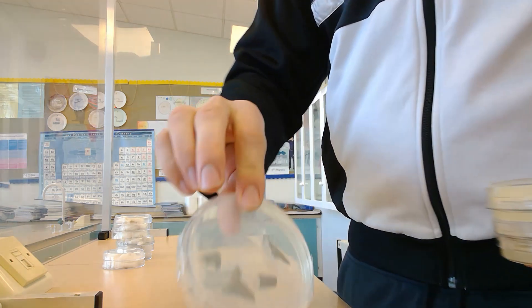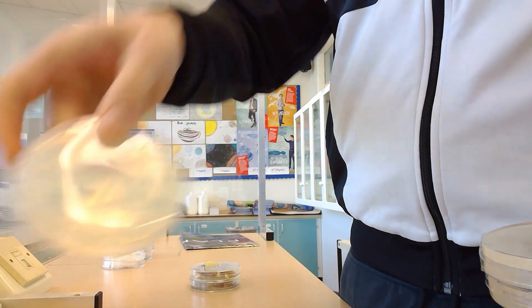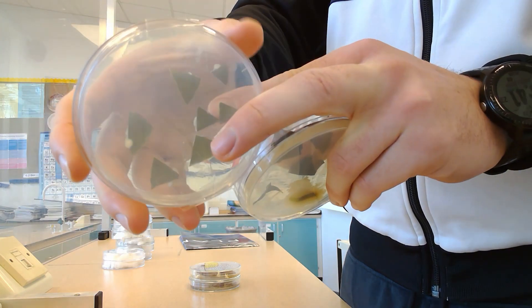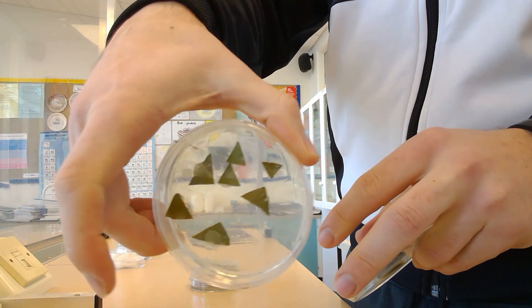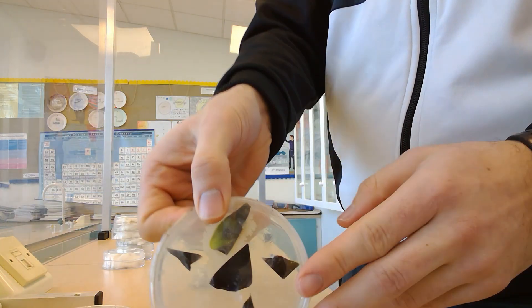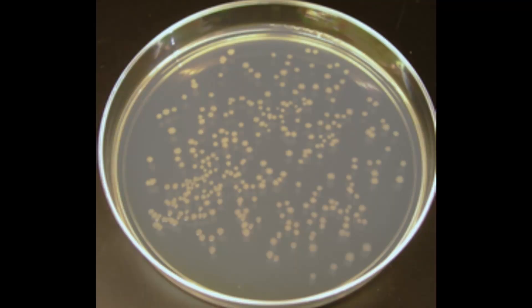Here are the results. The first plate had no growth whatsoever — no leaf yeast. The control plate also had no growth, which is what we'd expect. One plate did have a few small colonies, which was brilliant to see, showing that there was in fact some leaf yeast present. The last plate didn't have leaf yeast, but one of the leaves fell onto the agar and we saw the development of some other fungi or bacteria. Just to show what a plate would look like during summer months, where leaf yeast is far more plentiful — you can see the shiny pink colonies on the agar plate.